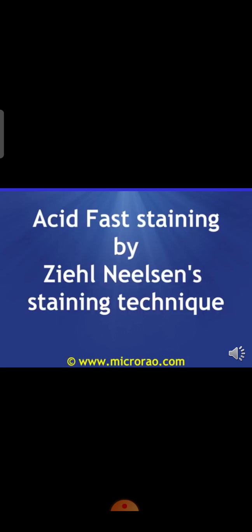After that, we remove the excess water from the surface of the slide, and then we apply the decolorizing agent. Here, the decolorizing agent in the Ziehl-Neelsen staining technique is 20% H2SO4. We apply the 20% H2SO4 on the surface of the slide for 1 to 2 minutes. After that, we wash off the decolorizer using water, and we remove the excess water from the surface of the slide. Then we apply the counter stain.